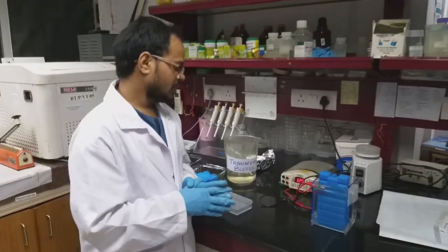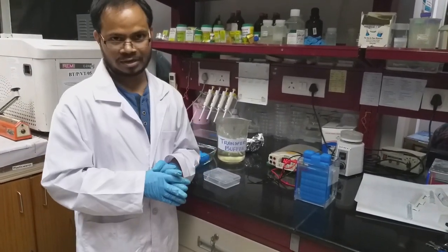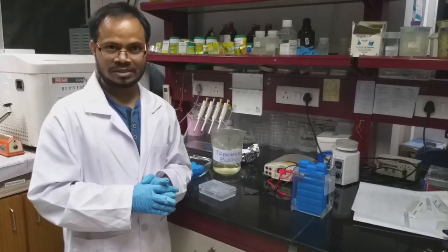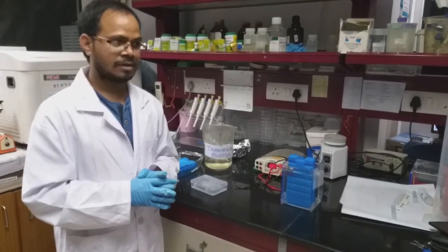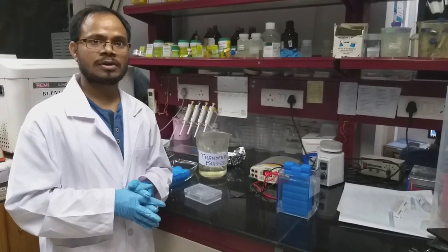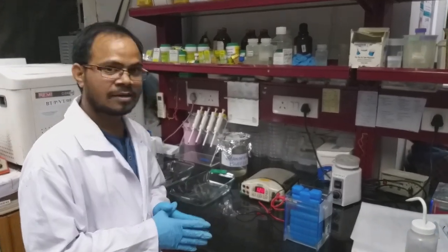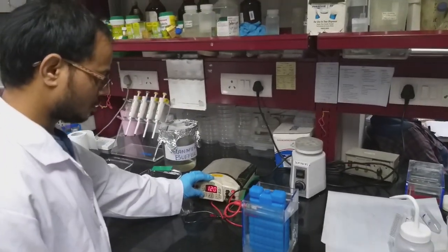Now transfer is going on. How much voltage we need to give depends on the transfer and varies. Generally in our lab we will give at least 2 hours of transfer at 120 volts, which is sufficient to transfer even low molecular weight proteins. But it also varies from instrument to instrument. You need to optimize before doing transfer. After 2 hours we have to remove the blot and incubate with the blocking buffer. So I am going to stop here.